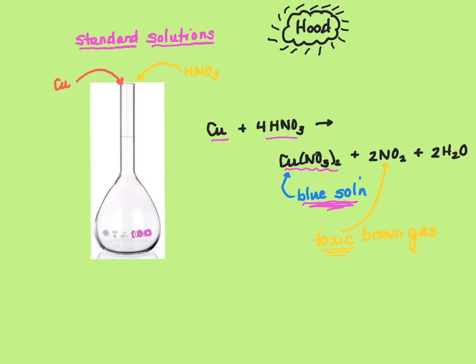NO2 is a toxic gas. It's brown and it's poisonous. So we will be doing this in the hood. You can't breathe in NO2. A little teeny tiny bit's not going to hurt you at all, but we can't have it generated in the room. So you've got to make sure you stay in the hood.